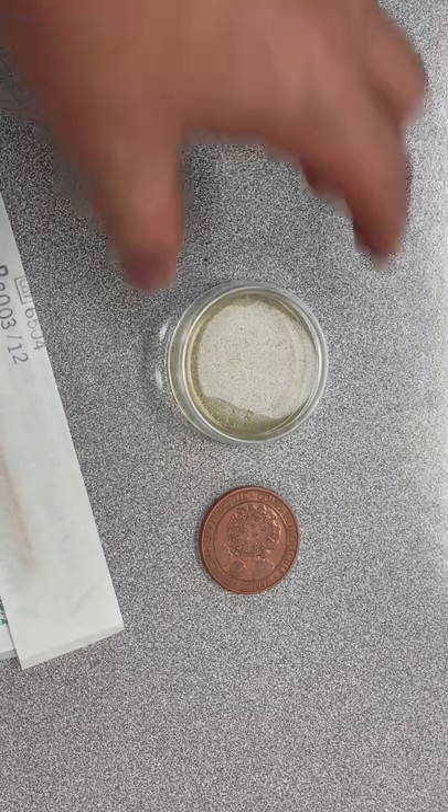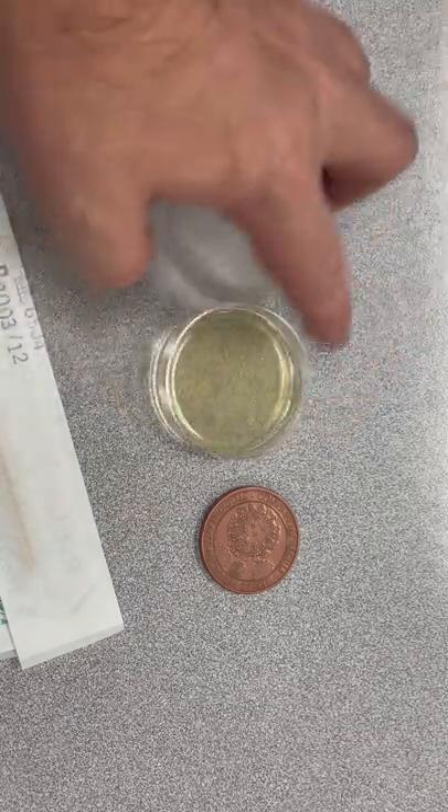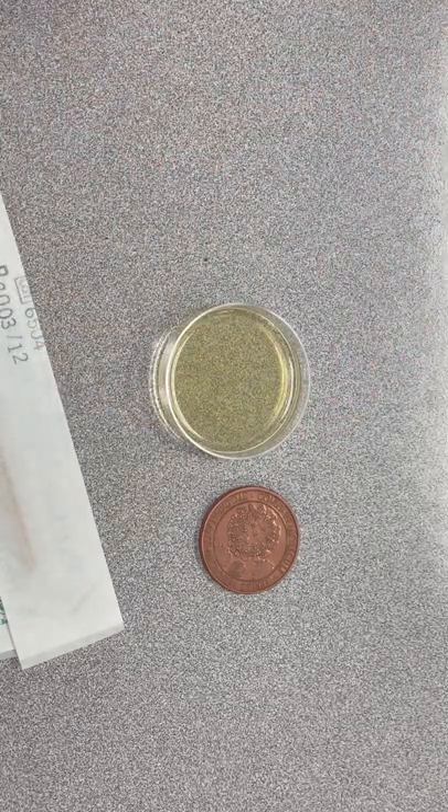So what we have here is a little petri dish, and inside here — I think I'm pronouncing this right — it's called agar?